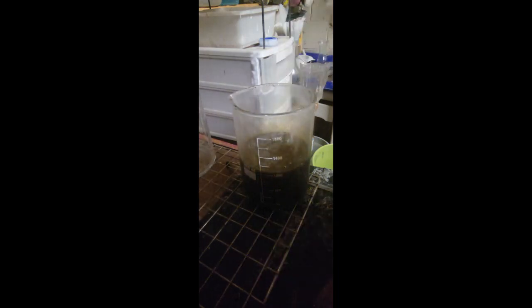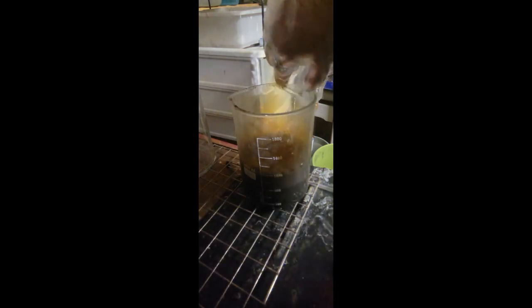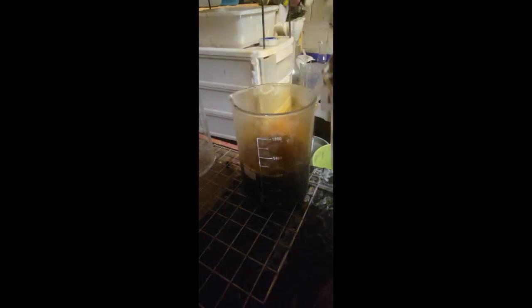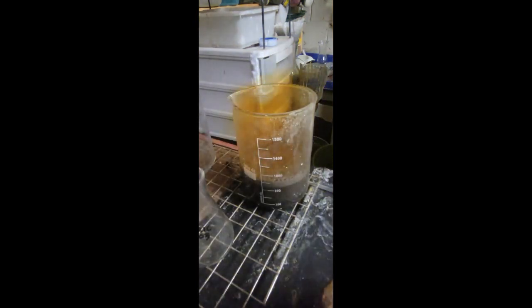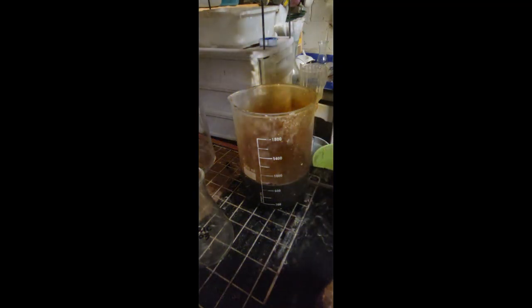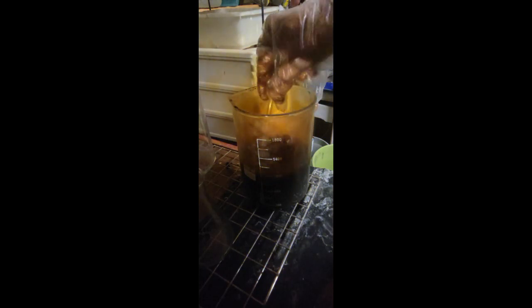This is why you be very careful when you dump in your acid, that you have a tall enough beaker to avoid any overflows, okay? Now, this stuff here is nitrogen dioxide gas. You do not want to breathe this nasty stuff in. It is toxic to you, all right?